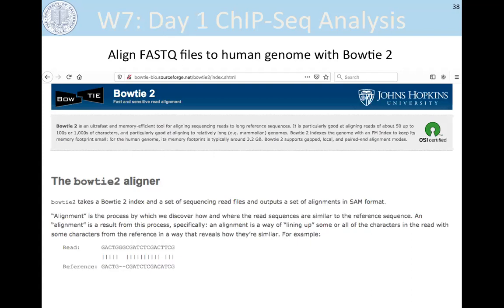Typically you want to have each read aligned to only one region of your reference, since it only came from one region of the genome. So if it scores similarly between 2 regions, for example, and doesn't have a different score between them, then we aren't going to assign the read to either region. That's the parameter we're going to use when we do the alignment, because we aren't confident as to which region the read aligns. We'd rather not have a false positive.